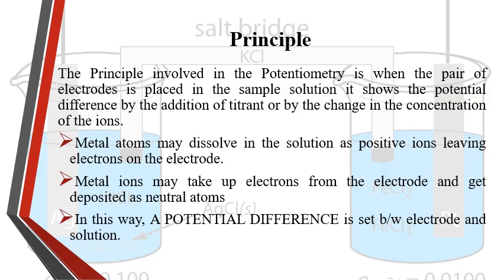During titration, the active ingredient being determined produces an electric potential with a suitable indicator electrode. The titration is followed by the fall in potential as the ingredient is used up by the titrant.